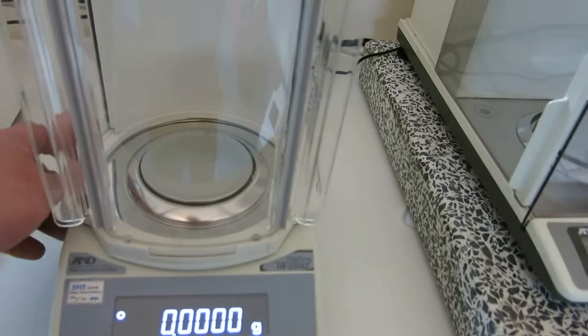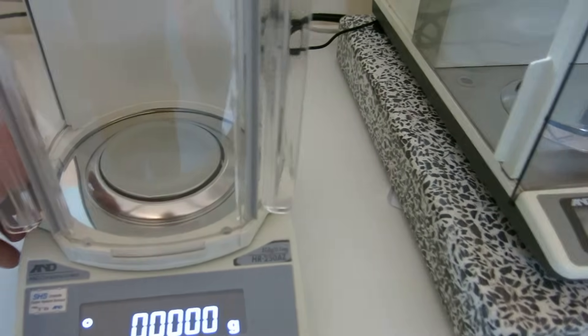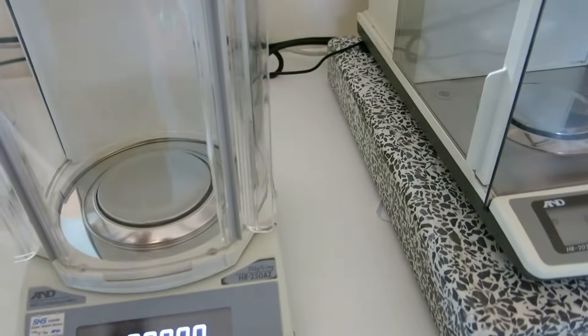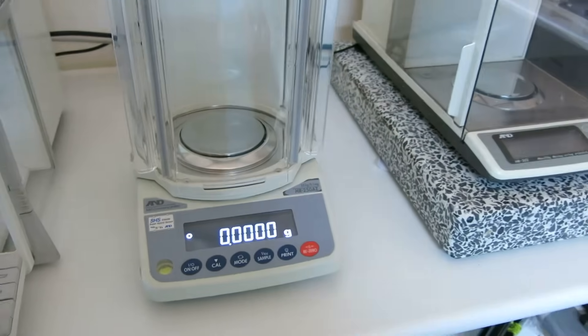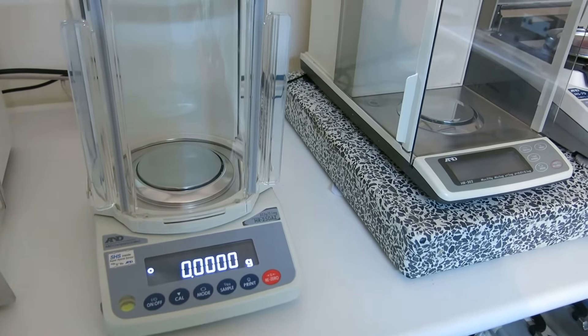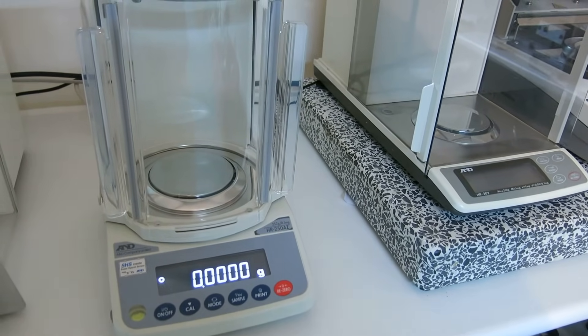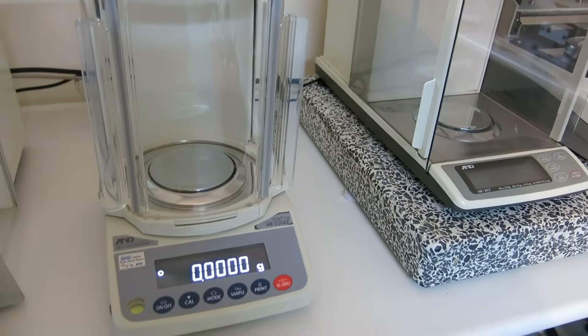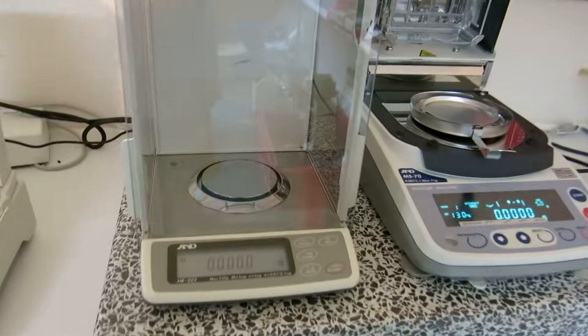The draft shield comes off as well for ease of cleaning, with two simple clips on the side here. For more detail have a look on our website. But really good 250g internal calibration balance. I've sold a lot of these. And they're very popular for good reason. An excellent balance at a good price.